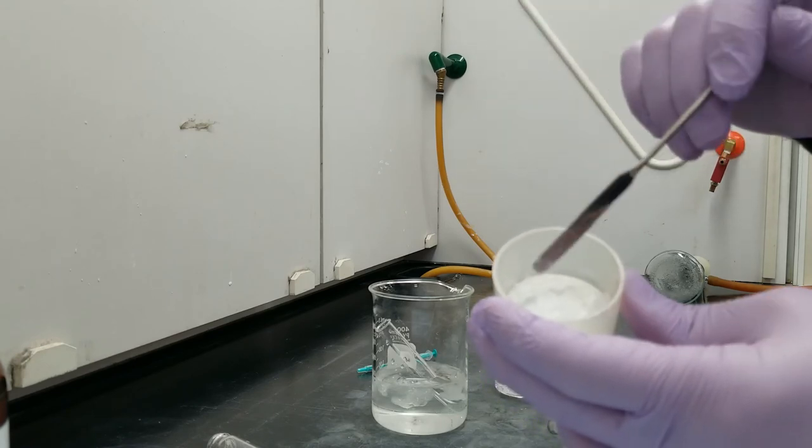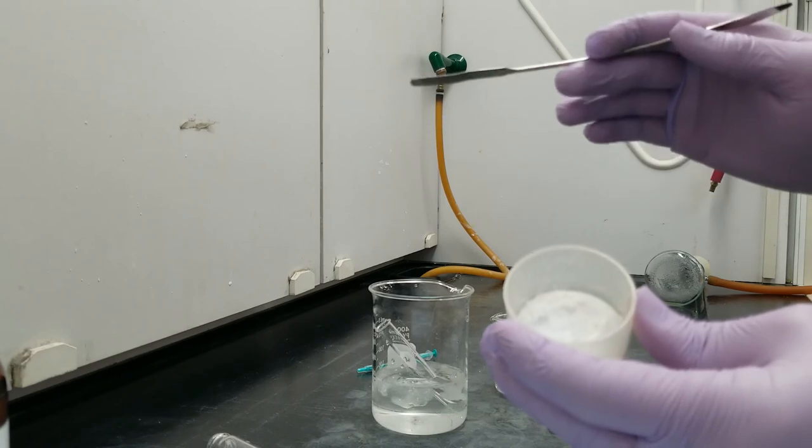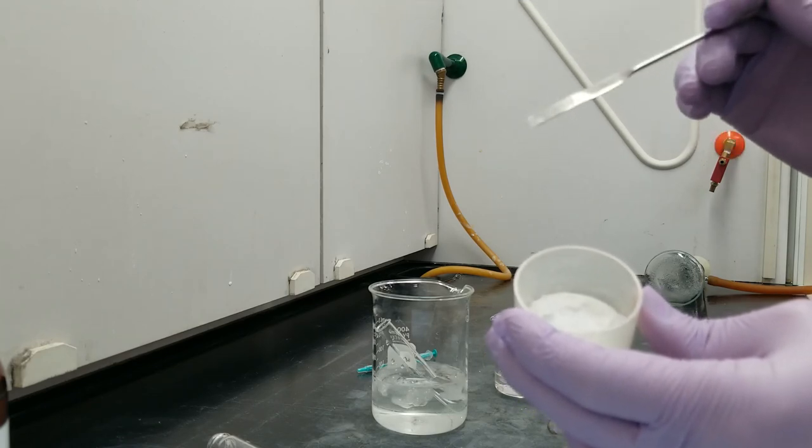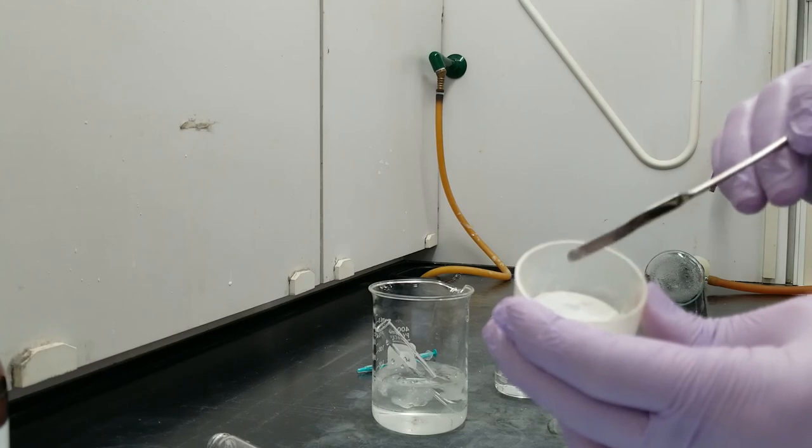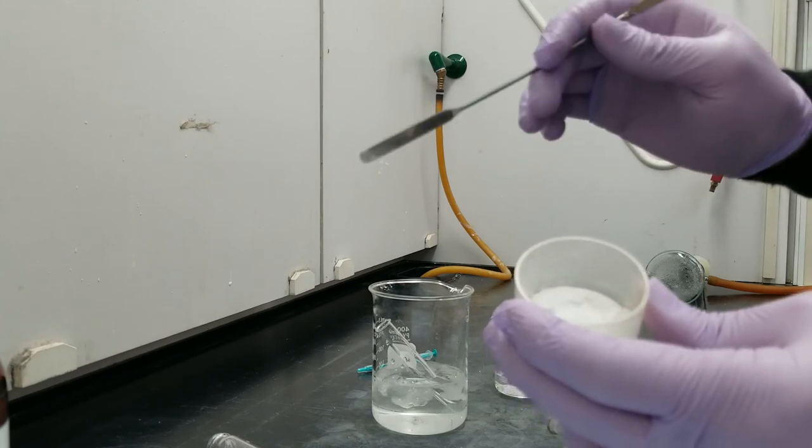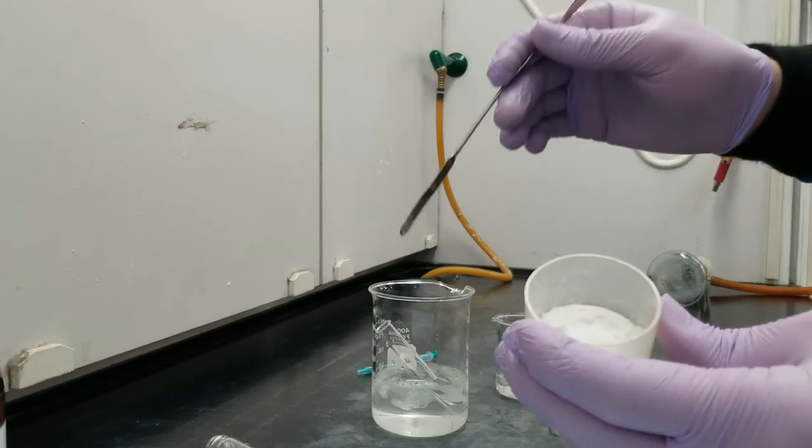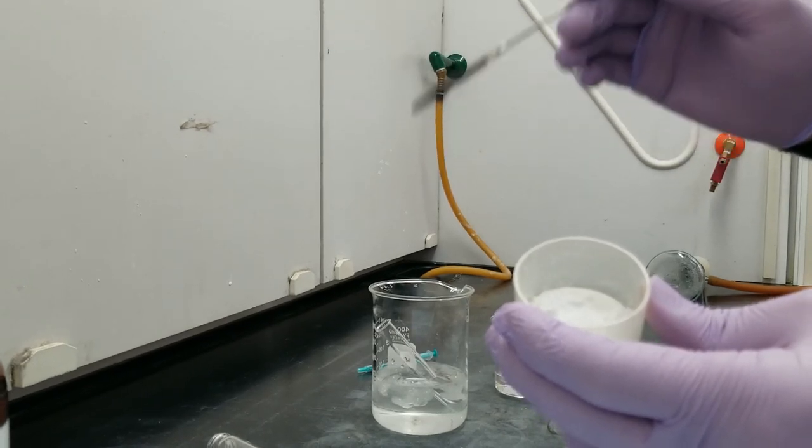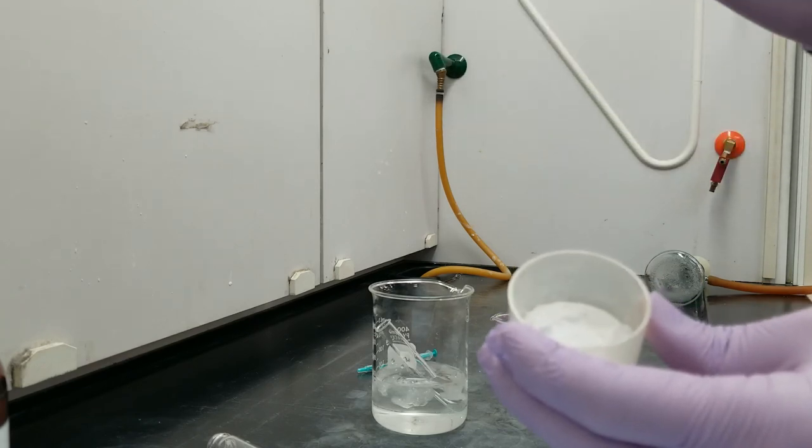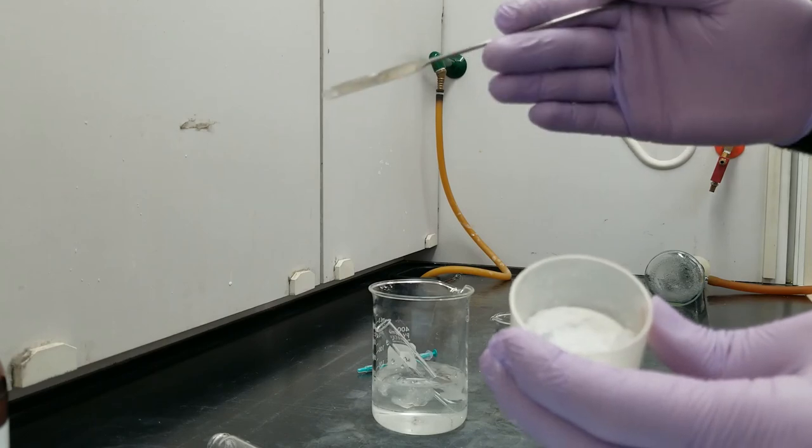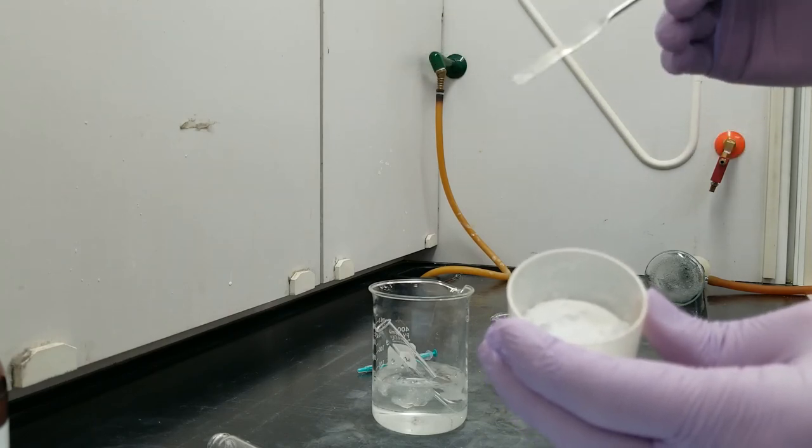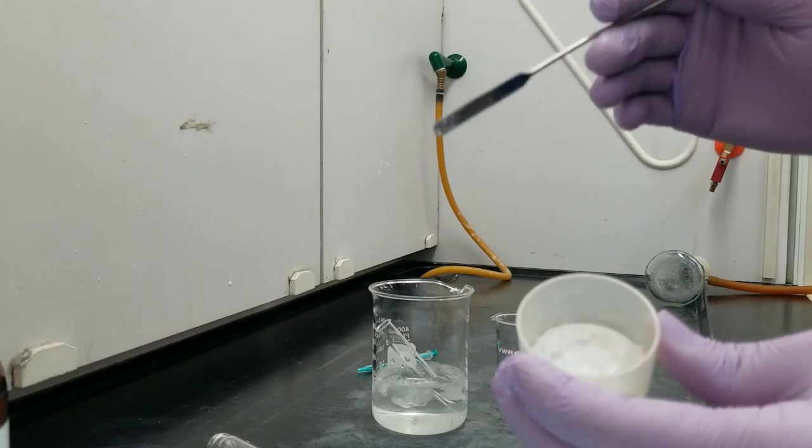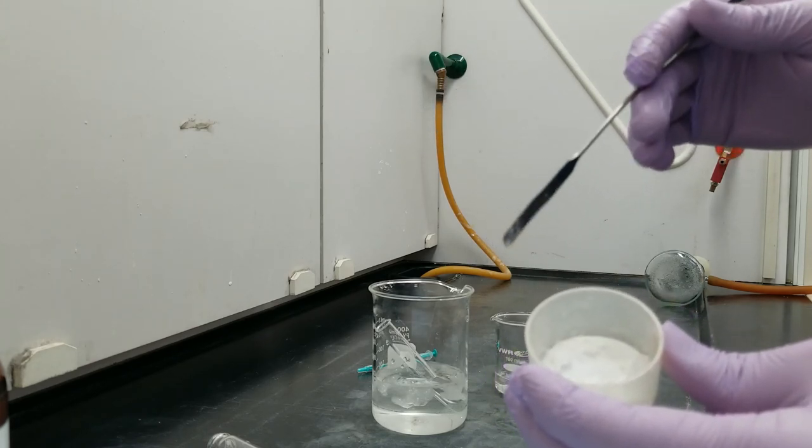Even further than that, we're going to get a mass of this. And we're going to make the very bold assumption that we collected all of the adduct that was made. So, it's 100% yield assumed. If we have the mass of this, and we have the molar mass of the adduct, and we know which adduct it actually is, then we will know the moles of adduct that we made. And if we know the moles of adduct that was made, then we can back calculate, because it was a one-to-one reaction, we'll know that that's the same number of moles of diene that we started with. And just as a further note, the molar mass of the adduct is exactly the molar mass of maleic anhydride plus the molar mass of the original diene.